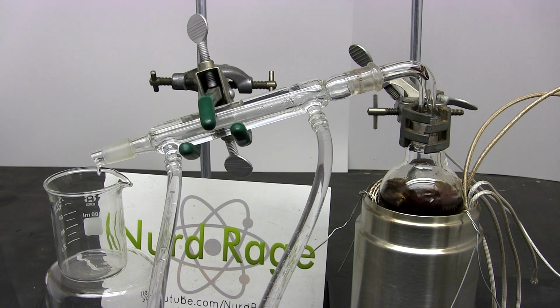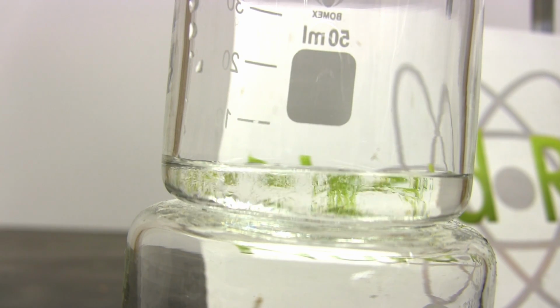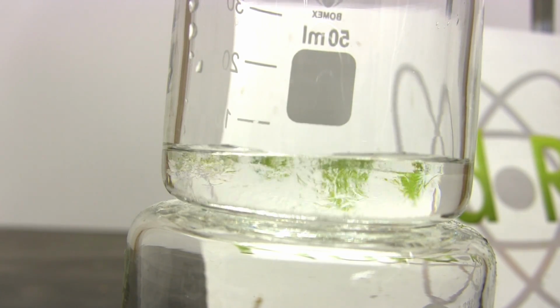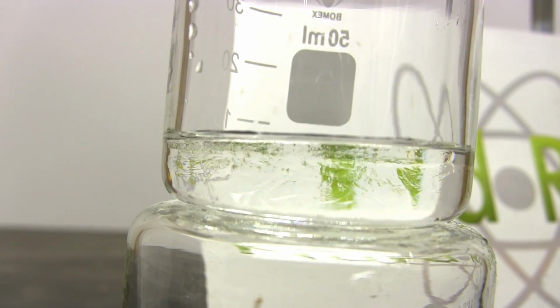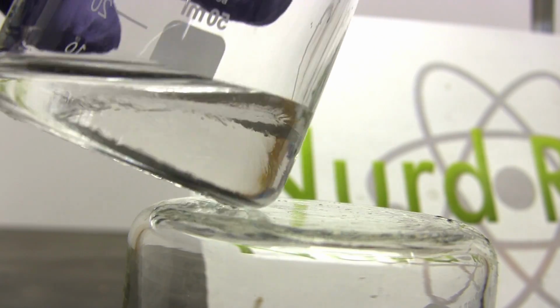To know when we're at that concentration, pay close attention to the distillate in the receiving beaker. Here is a separate run with smaller beakers for clarity. Anyway, as the acid distills, if the concentration is still increasing, then you'll get these distortions as light refracts through the changing density of the acid. It's best to have a picture or something behind the beaker to easily see this. Now, if you do see these distortions, then change out the receiving beaker.